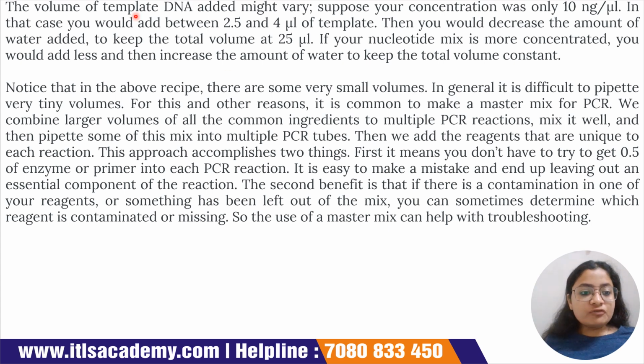Okay, so the volume of template DNA added might vary, exactly what I said. Suppose your concentration was only 10 nanogram per microliter. In that case, you have to add between 2.5 and 4 microliter of template. Then you will decrease the amount of water added to keep the total volume at 25 microliter. Meaning we will not make the total volume more than 25 microliter, neither more nor less. Ideally 25 microliter will be our total volume of the master mix. Okay. If your nucleotide mix is more concentrated, you would add less and then increase the amount of water to keep the total volume constant.